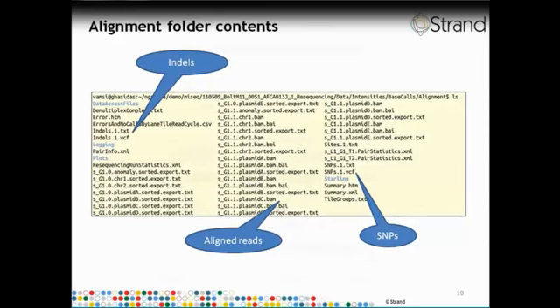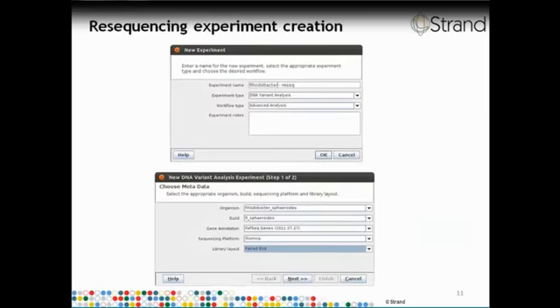After we choose that, it automatically analyzes all the files present in that particular folder, identifies which of them are aligned read files, and those are the BAM files. It looks up the sample naming sheet and identifies that sample 1 actually corresponds to a sample which is RB1. It fills in the proper sample name. Then we just need to click on finish, and all of the data is loaded into Avadis NGS, and a DNA variant analysis experiment is created.